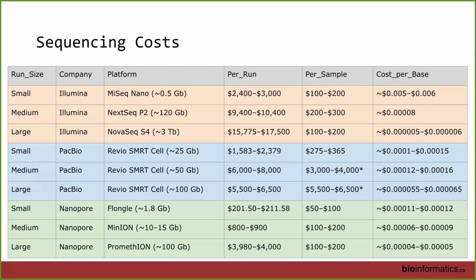But if you're looking at per genome or per MAG, you have the possibility of making very, very high quality population genomes from long read data. And so if your interest is to find these genomes, you may actually do better spending a little bit more per base pair on HiFi if you have the possibility of having more genomes that are higher quality at the end of your process.